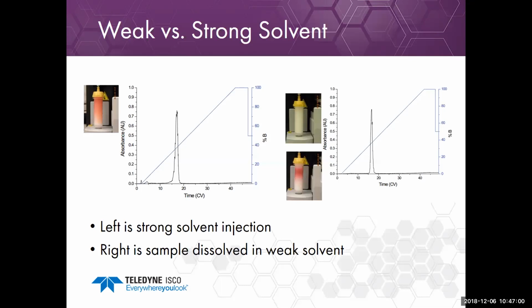So it can be very difficult to match your TLC results with a used silica column, because you've changed the surface chemistry because the solvent's absorbed on the column. The other thing is silica tends to bind very polar compounds very tightly, so your column actually acts as if it were a shorter column.